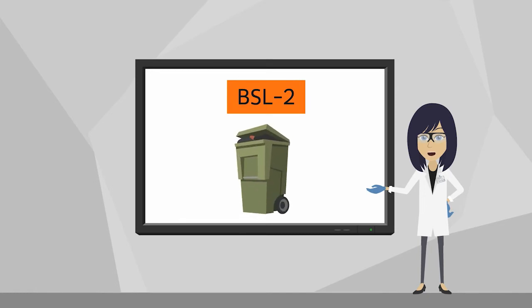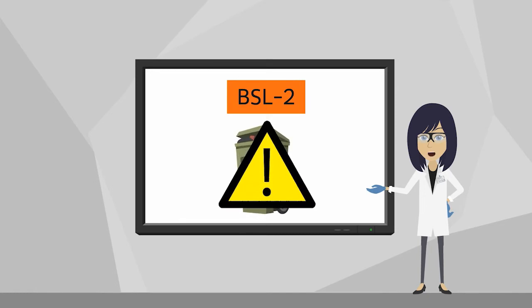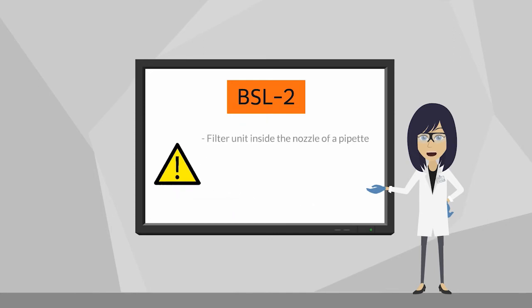Waste disposal is even more stringent when working in a biosafety level 2 environment, such as the filter unit inside the nozzle of a pipette, strict decontamination procedures before disposal, and other cautionary measures to avoid spills.